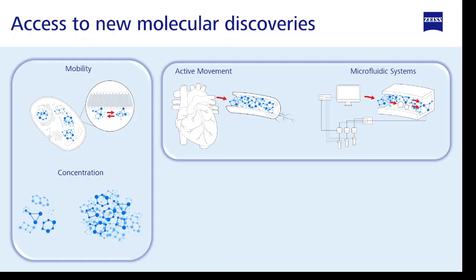Apart from those conventional results we can get from FCS, dynamic profiler offers us 2 more analysis options. The first one is flow analysis. Dynamic profiler can use the spatial information of the area scan detector to give us the flow speed and flow direction of certain molecules at certain spots.